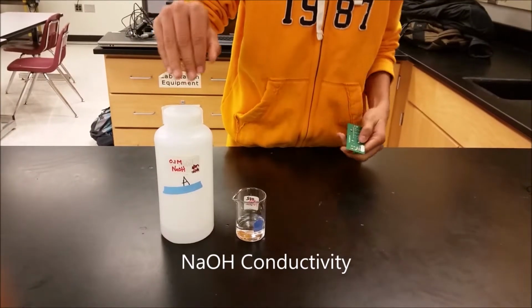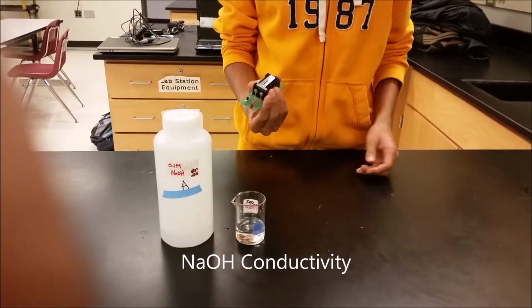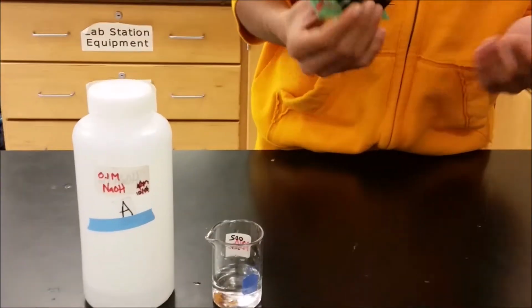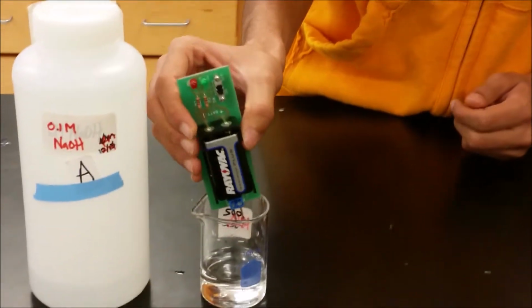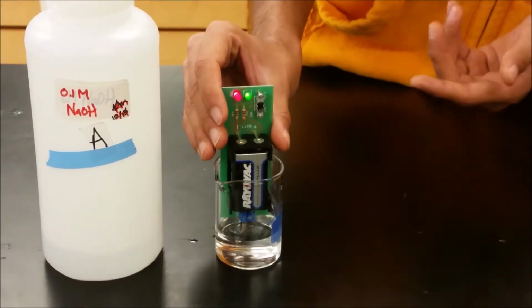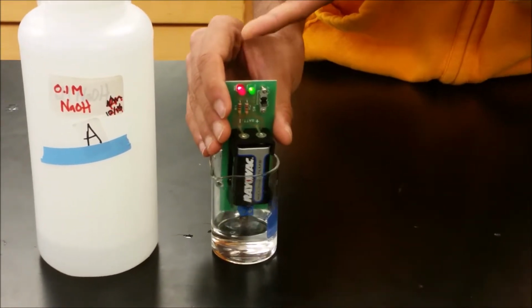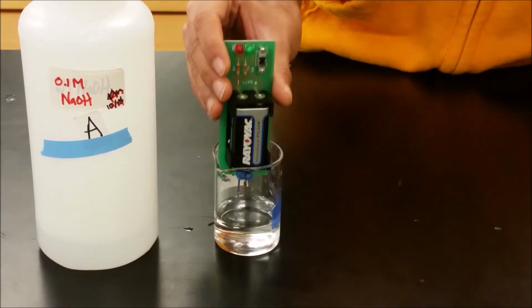We have 0.1 molar NaOH, and I poured 40 milliliters of it into this beaker right here, and we're going to test the conductivity of the solution with this conductivity probe. As you can see, the conductivity probe is lit bright red, and it's kind of dimly lit green.